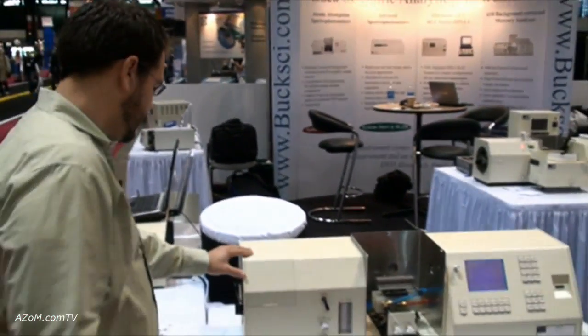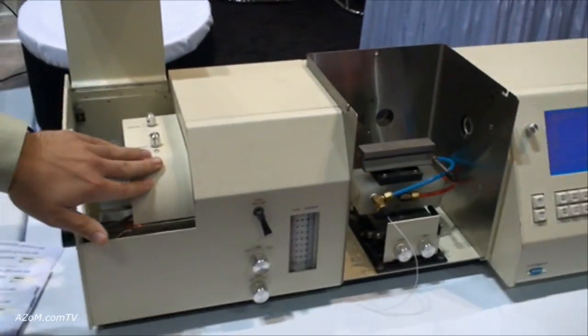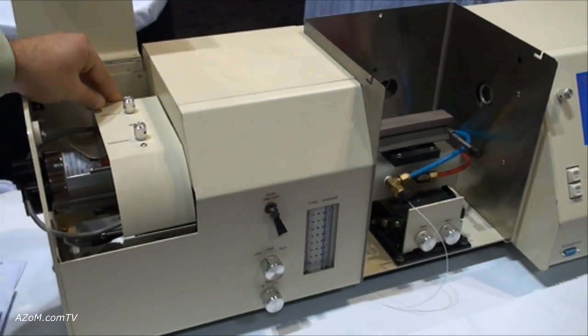This is our 210 atomic absorption spectrophotometer. It has a three-lamp manual turret, so there's one lamp for analysis while two are being warmed up for the next analysis.